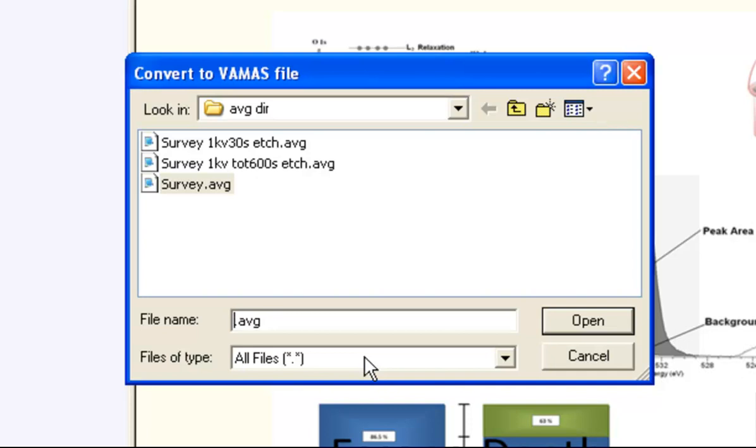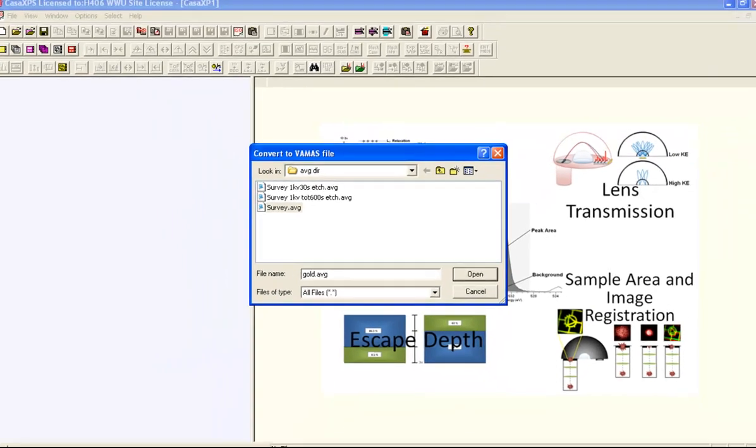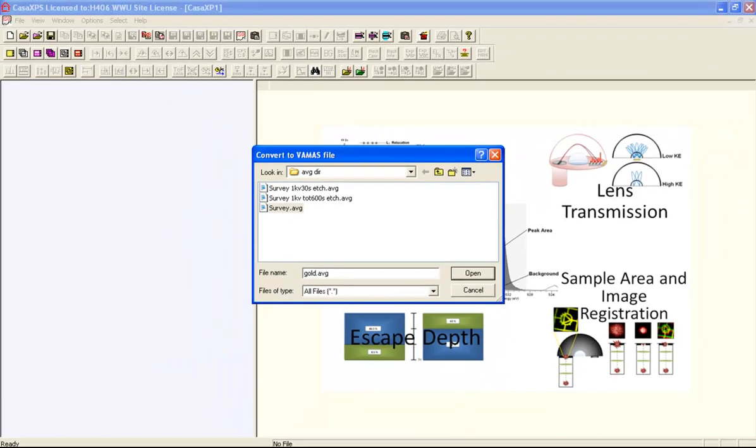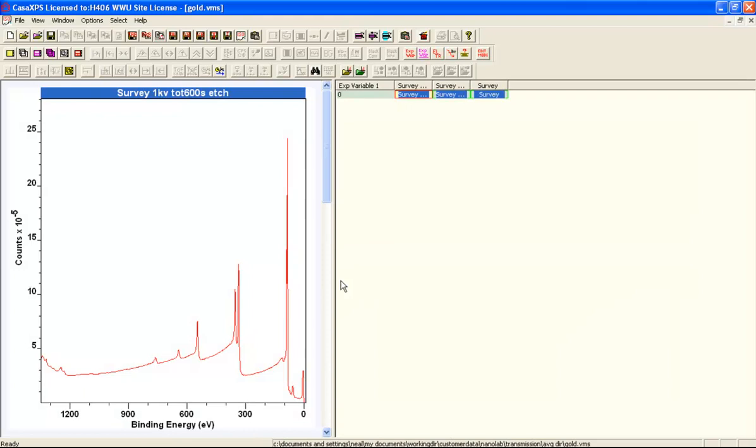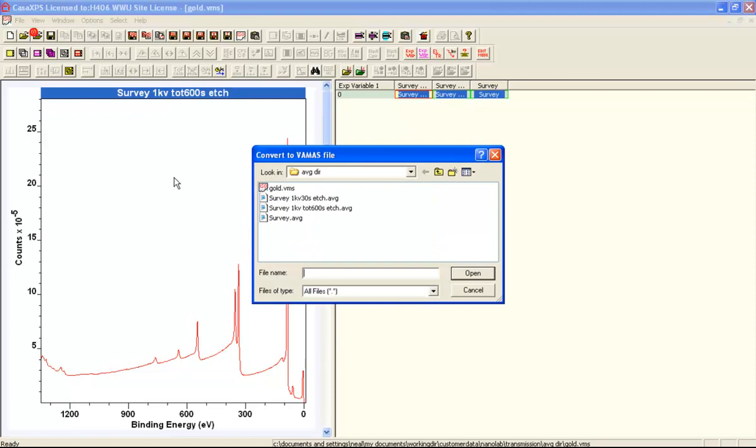All the ones you wish to convert into the same VAMAS file you place in the same directory, and then you can give it a name such as GOLD.AVG. The .AVG instructs CASA to read all the AVG files in this directory and will create a new VAMAS file that contains the spectra found in these AVG files.